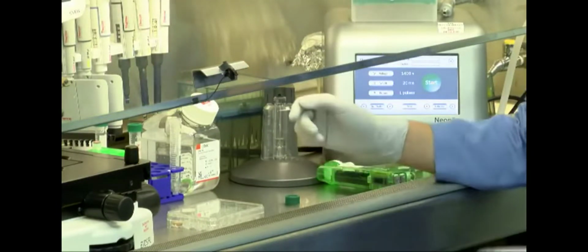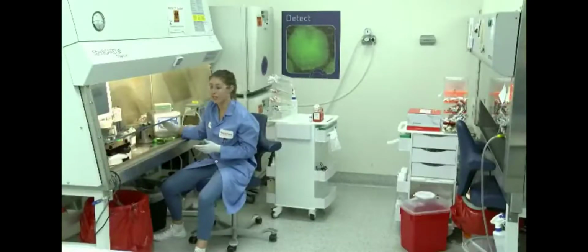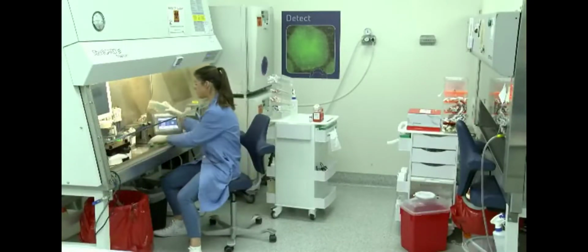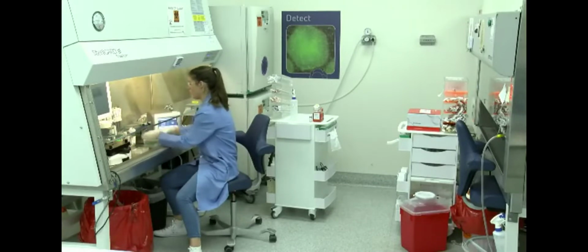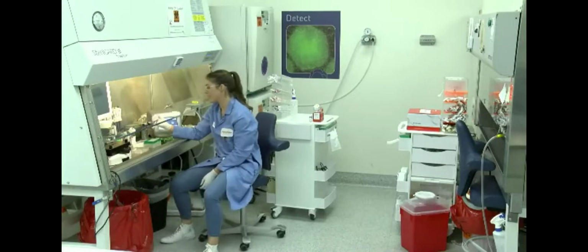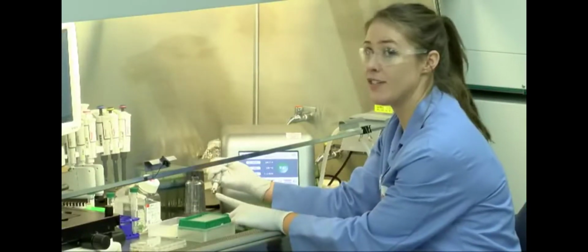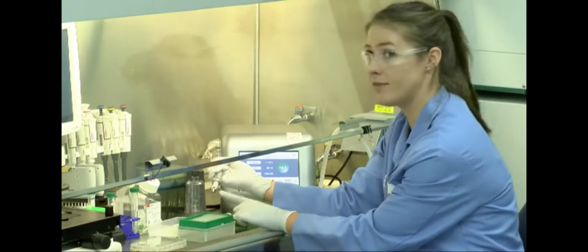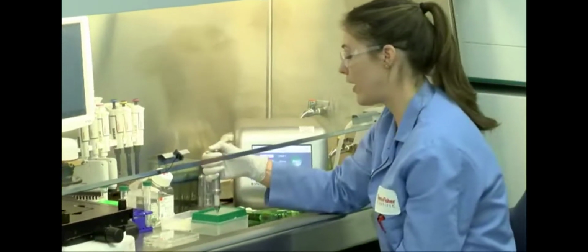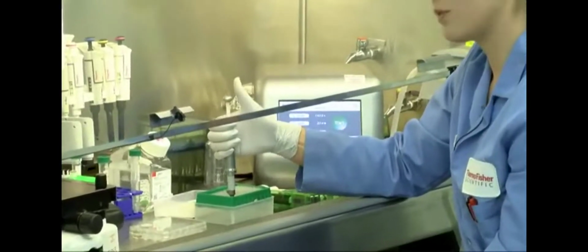So the first thing you want to do is make sure that the Neon pipette tip is properly attached to the Neon pipette. To do this, you want to take the pipette and depress the plunger all the way down until the clip at the end of the pipette is open. And then you want to put a good amount of downward force onto the Neon pipette tip and then just release the plunger. And then your tip should be properly attached.